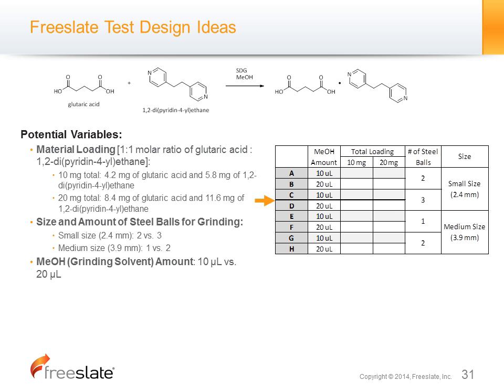So here is a little library. Typically, if we do full plate scale experiment screening, we do 8x12, 96 well conditions. But in this case, it's a test case. This is the interaction between all these variables, and every variable will see the other possibilities. If you see the design here, you have methanol on the column side, and within there a total loading of 10 mg versus 20 mg, and the steel ball size and the amount are also listed here.